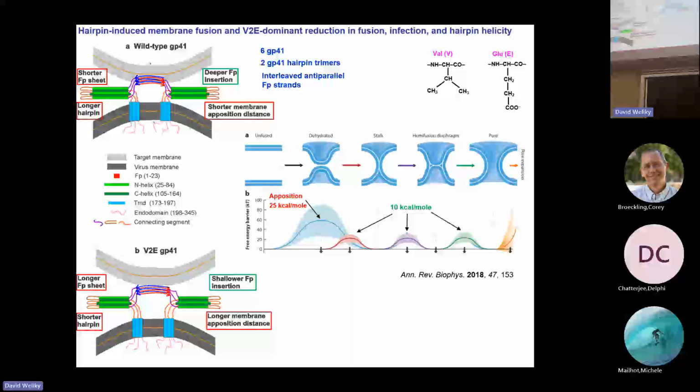So in doing these experiments, you would be inherently limited by intramolecular transfer. Yeah, if you do that, then your data will be completely dominated by intramolecular transfer. We have done some of those experiments, not here yet, if you want to learn about the intramolecular structure.